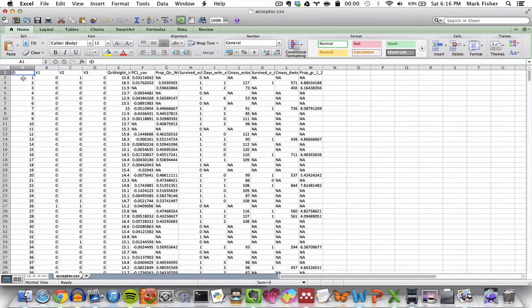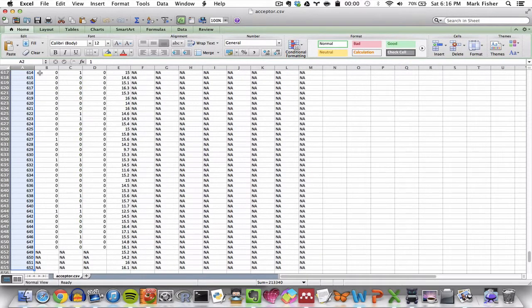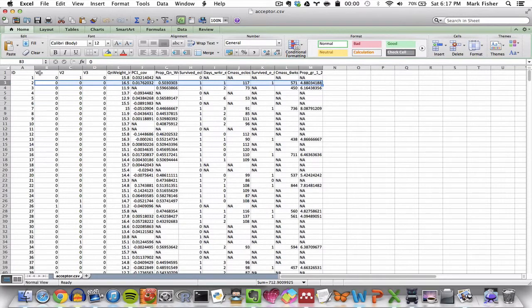You should know that the trait data is permitted to contain samples that are not present in the genotype data, and vice versa. Missing data or even entire missing samples, that is, a row of data with only the sample ID and all NA scores across the board, are also permitted. And also, for optimal results when the correlation heat map and correlation charts are generated, and we'll talk about that in a later video, the column headers here, aka the trait names, in the spreadsheet should be as short and as informative as possible. So really long names here are not advised for aesthetic reasons later on in the pipeline. And that's it.